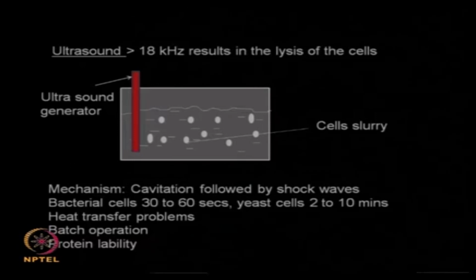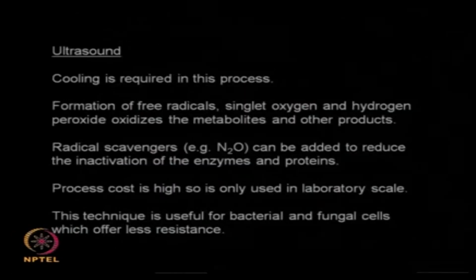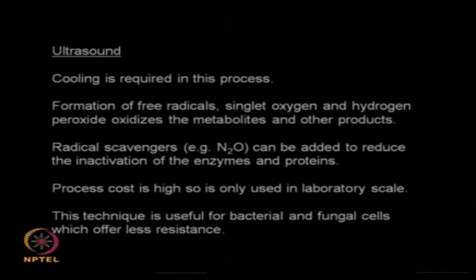The third problem is protein lability, that means a protein can get denatured because of the shock waves or because of the cavitation, because of the high temperature or hot spots generated. So you need to be very careful about this problem. So we need to have cooling in this type of situation.